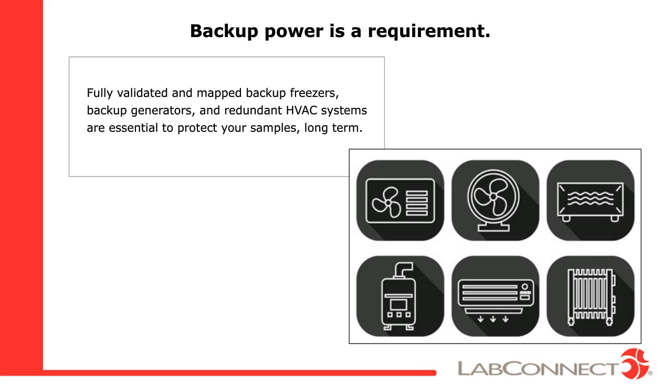I'm a big believer in Murphy's Law. So another point to make and to consider is to always have your primary and backup samples in different freezers should one go down.